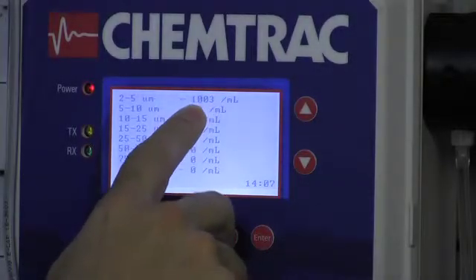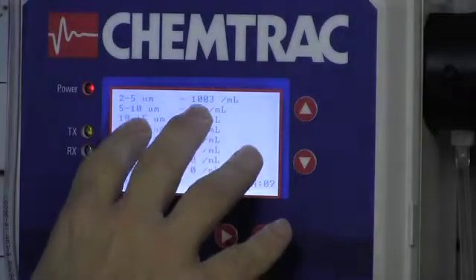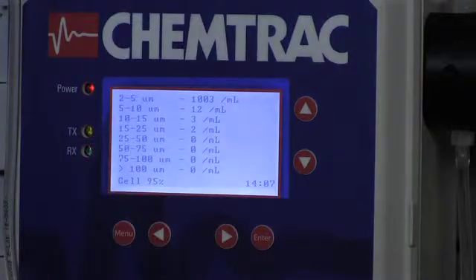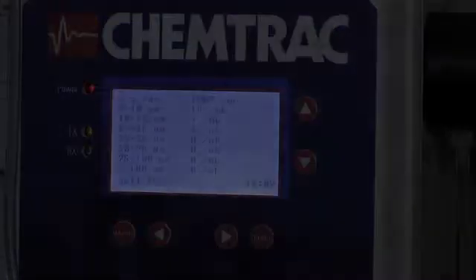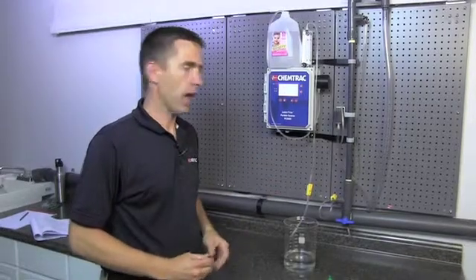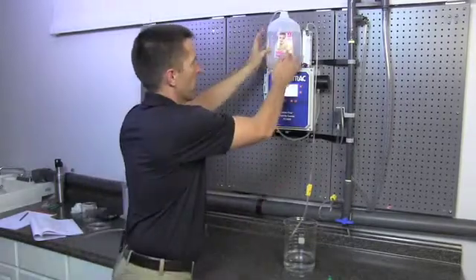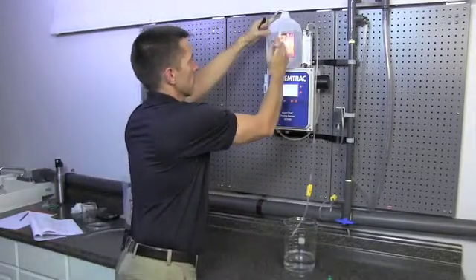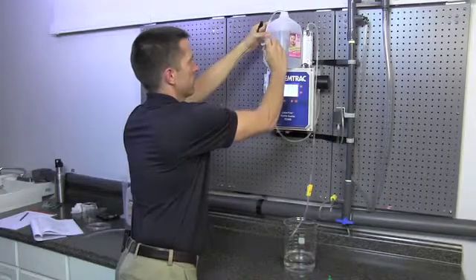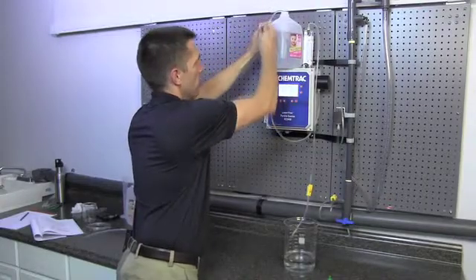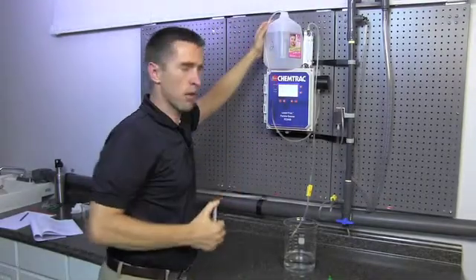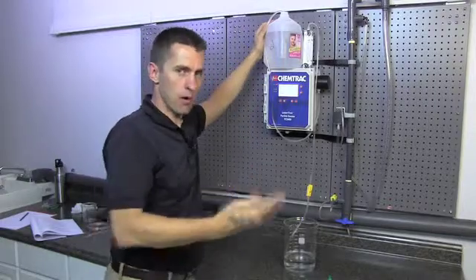So what we actually have here, as far as the calibration is concerned, is now a very accurate reading for the 2 micron particles. Now that we've completed the 2 micron calibration, one thing we want to make sure we do is mark our jug so that we know what's in it, because we have a lot of solution left, and we can reuse this solution to calibrate other particle counters.